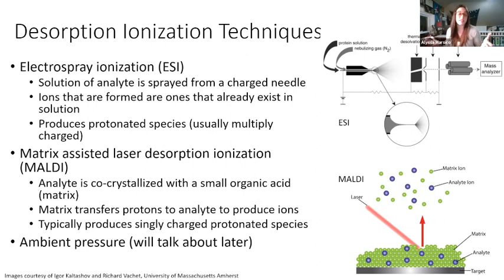So not only does matrix-assisted laser desorption ionization use lasers, so you get to fire lasers at samples, it's also a very quick mass spec technique. Most of these other mass spec techniques take a little while for you to get your sample ready to run through the instrument. With MALDI, you can get a mass spectrum in a fraction of a second.